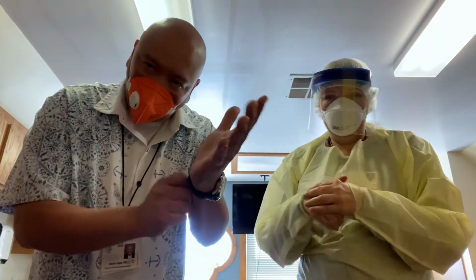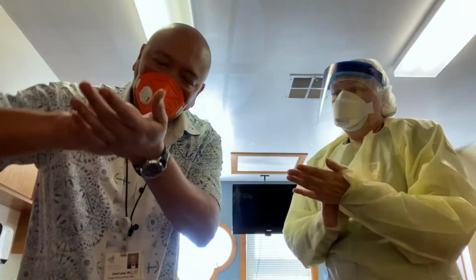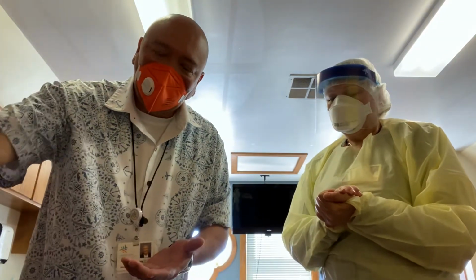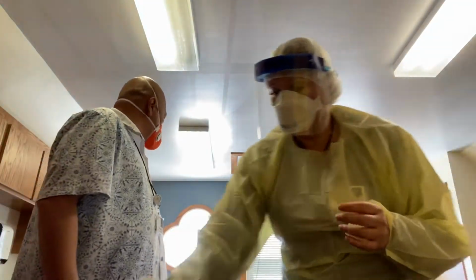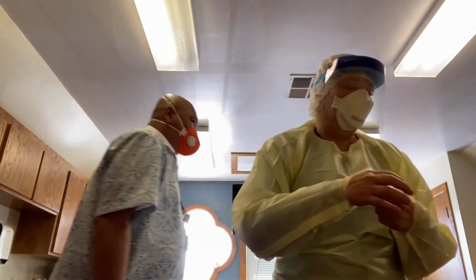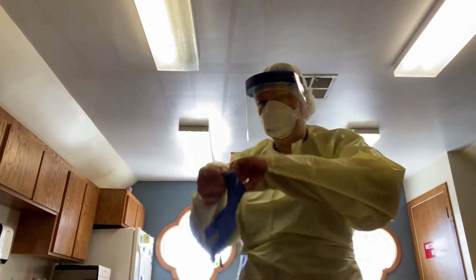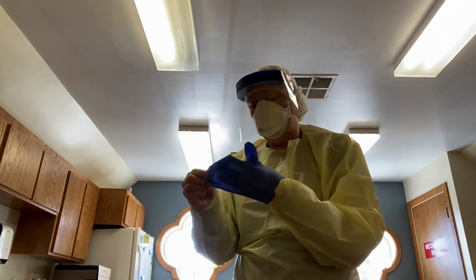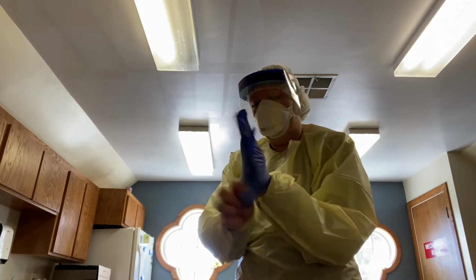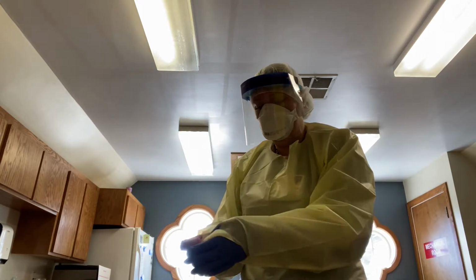Now, on the gloves part, when you're putting the gloves on, that's the first layer. The first layer must never be peeled off in the process of working. The first layer of gloves she applies underneath the gown. And then we need some tape. The first layer of gloves goes on under the gown. They don't have to be sterile, they just have to be clean.